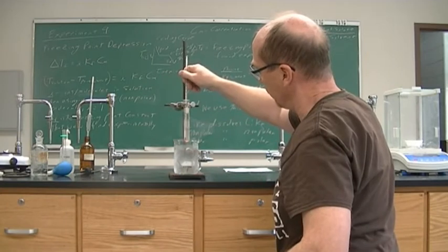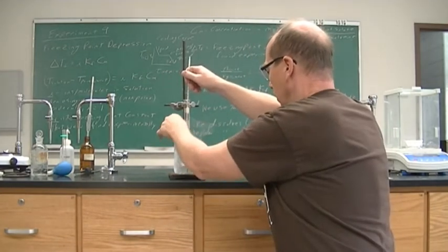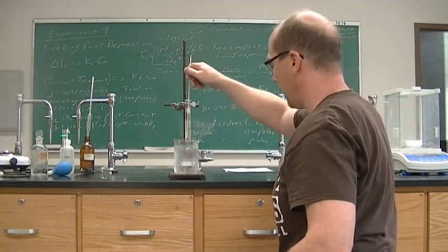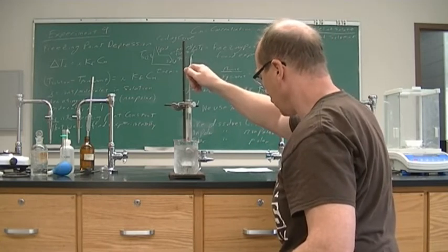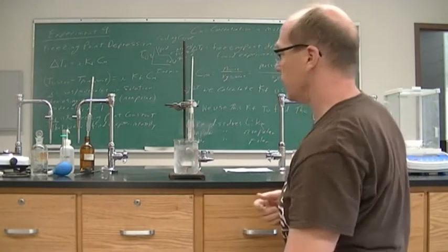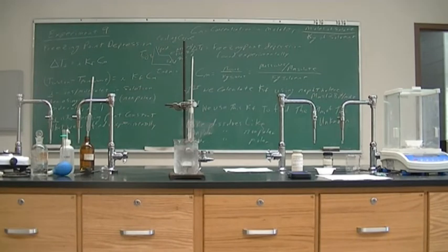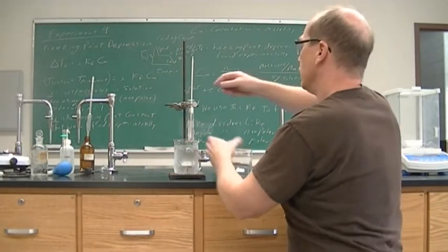It's liquid, but it's not warm enough to dissolve the 0.1159 grams of naphthalene. All right, so I may want to get a warm water bath. And that'll warm it up faster than the air temperature.